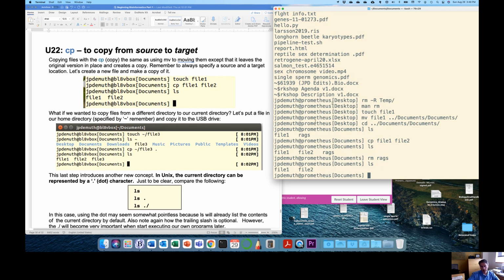Now, a lot of things I'm obviously doing here are not in the tutorial, but hopefully part of the reason that you've got the tutorial and I'm walking through this is so you're also seeing the utility of some of the commands as they come up in real life situations, right?